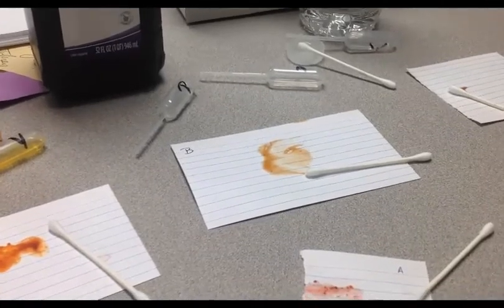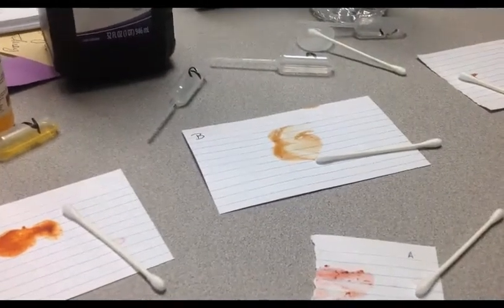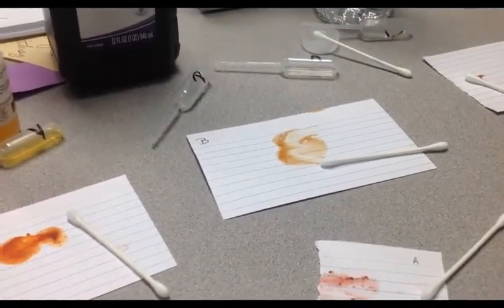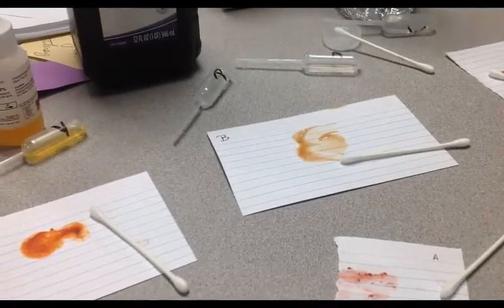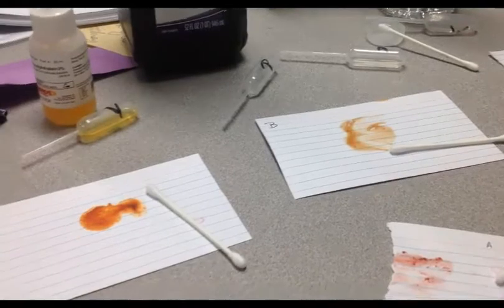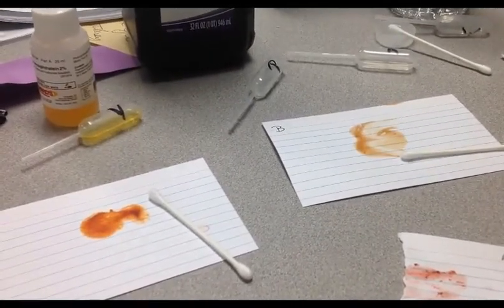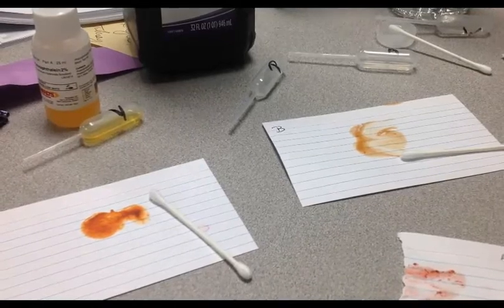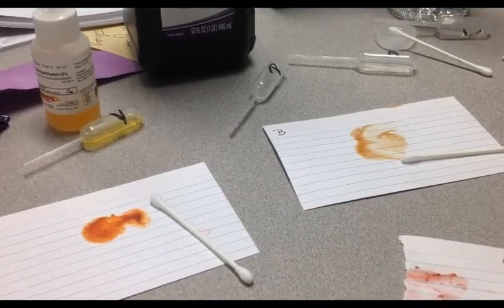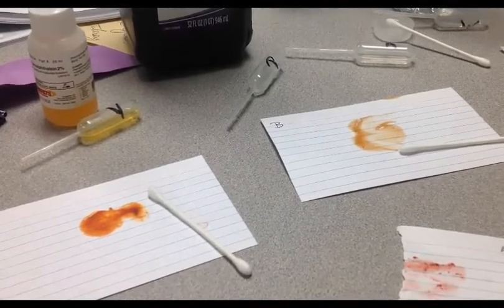The alcohol is added because with blood in the sample, it will break the hemoglobin in the blood cells, releasing them. You will then add phenolphthalein, which is a yellow tint, to it, and let the phenolphthalein absorb into the Q-tip. Then you will add hydrogen peroxide.